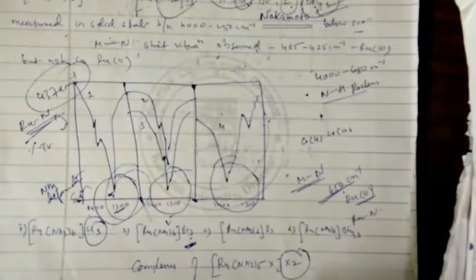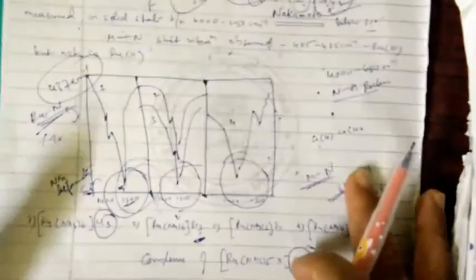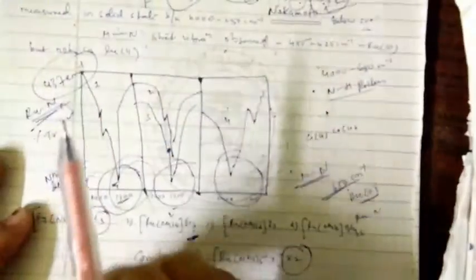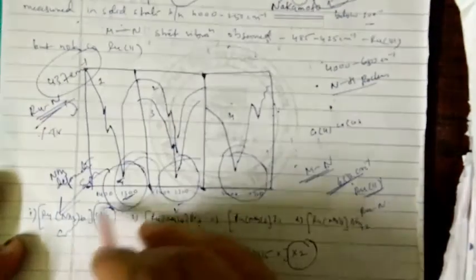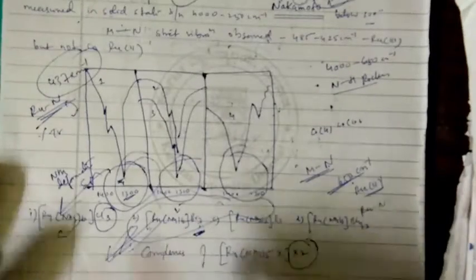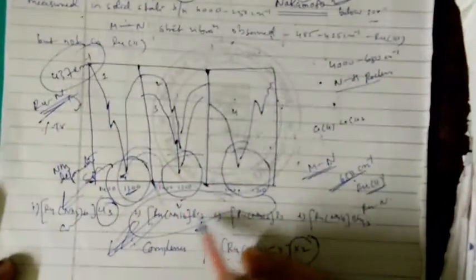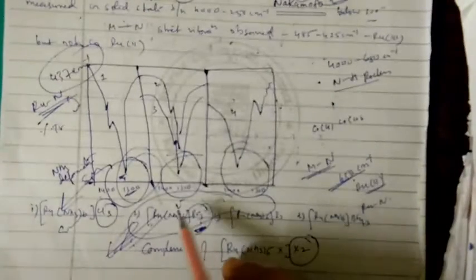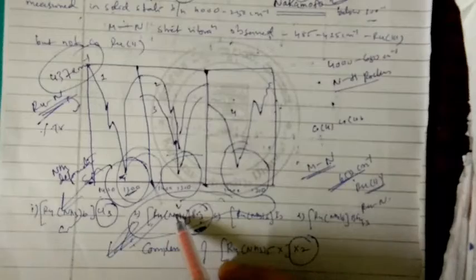We require learning this very slowly, because this is new IR spectroscopy. In organic chemistry it is very easy to understand, but for inorganic complexes you require a little time, and we have to gain experience with these spectra while we prepare the complexes. Then it becomes easy for us to understand the change in the IR vibrations upon bonding with the halides, as well as the change in the vibrations between the metal and the ligands.